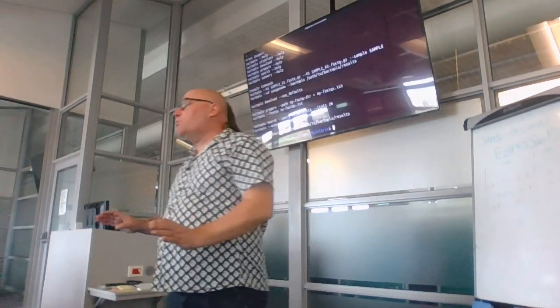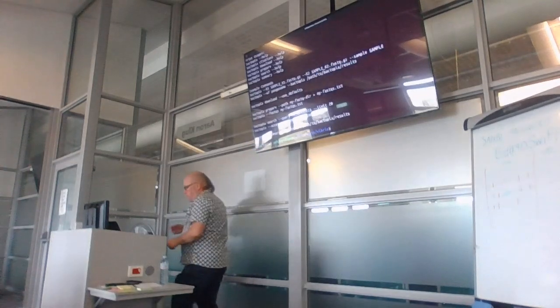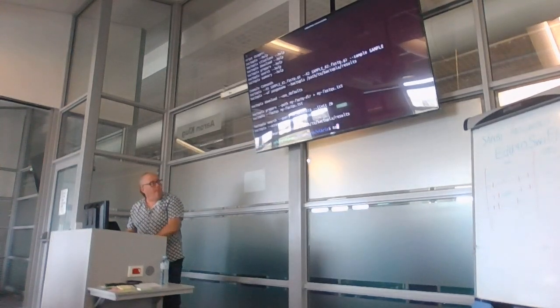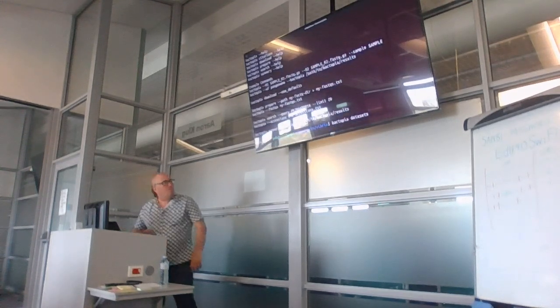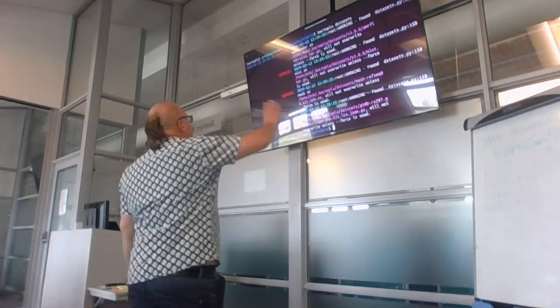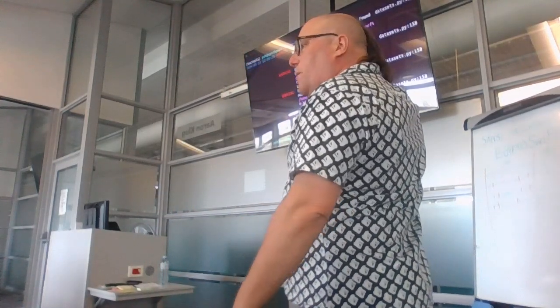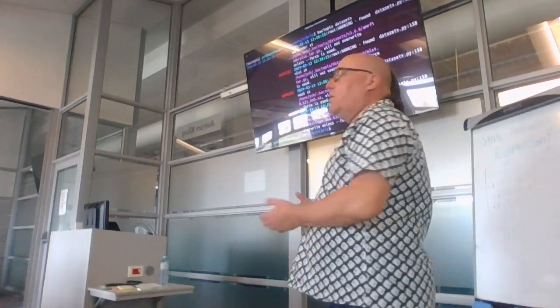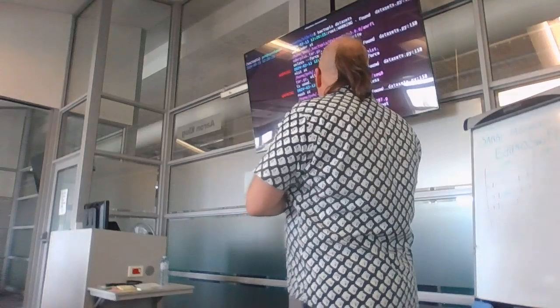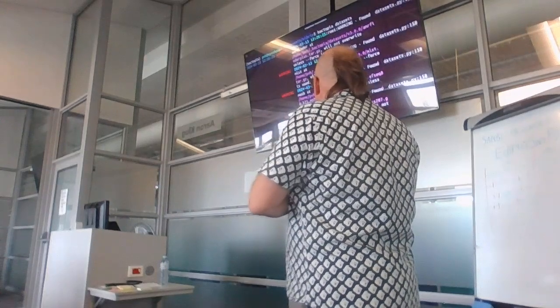Normally, the first thing that you ever do after you've installed Bactopia is that you run bactopia datasets. Don't worry about the messages, that's because I've run this command before. But if you say bactopia datasets, then it downloads the databases that Bactopia uses. So this is a few different databases. It'll take a while to run when you run it the first time, okay?